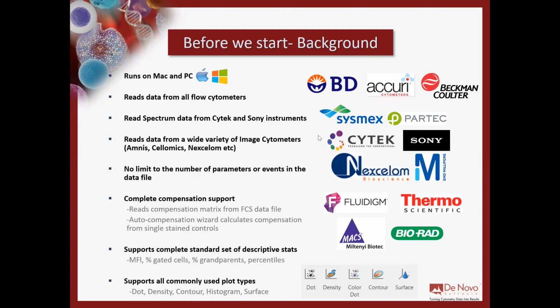Now, in one of our next training sessions, we're going to go over compensation in some detail, but rest assured that whether you're doing compensation at the time of acquisition or post-acquisition compensation in FCS Express, we can accommodate any and all forms of compensation that you want to do, including if you want to do your own unmixing in FCS Express when you come off of a Cytek or a Sony instrument.